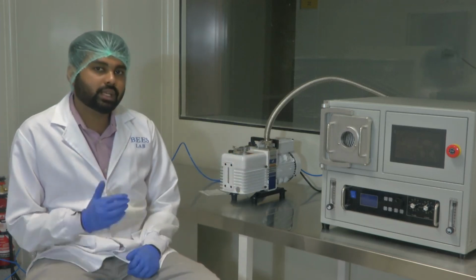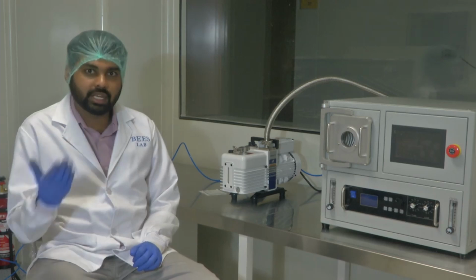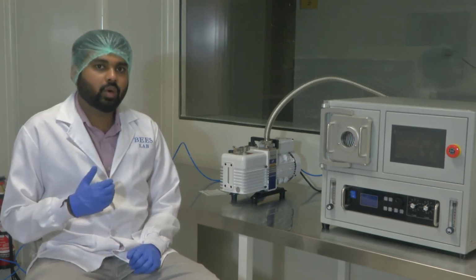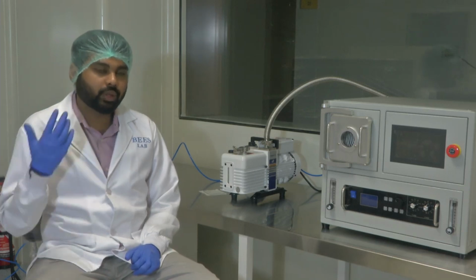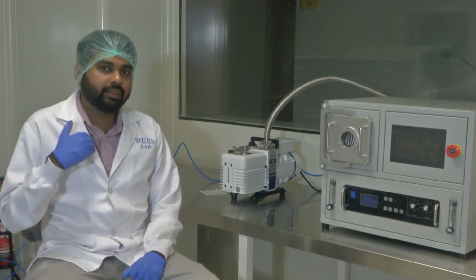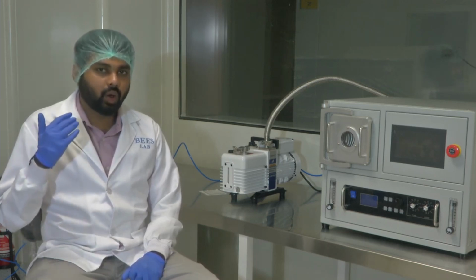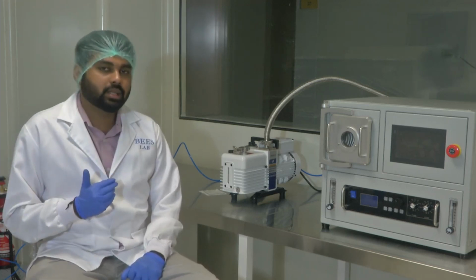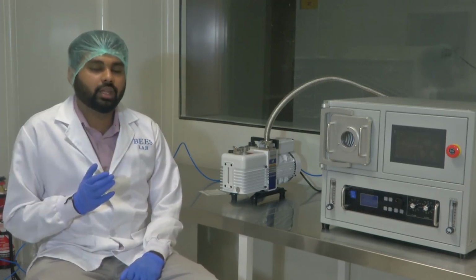Another thing to notice, this is radio frequency plasma generation, so it's about transmission lines. In transmission lines there is this idea called forward power and reverse power. Through impedance matching, you deliver some power at an RF frequency. Here it is 13.56 megahertz. At a particular RF frequency, you are delivering power to a load. Because the energy is transmitted over a frequency, there is always a reflection of energy, measured using the reflection parameter gamma. You might have studied this earlier in your engineering time.